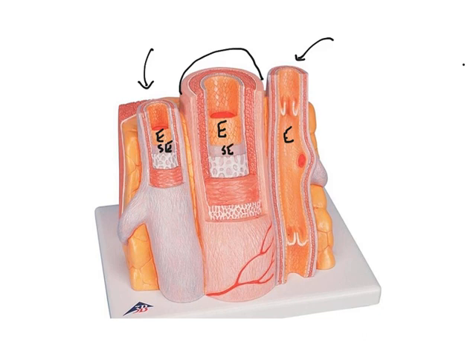Here you just have to look real careful. I'm not going to label on there because it's so thin. It's just that little gray that you see right in there. In an artery, you have this, which is called the internal elastic membrane. This is a mistake. Veins don't have that, so that should not be there. But in an artery, the tunica interna includes the endothelium, the subendothelial layer, as well as an internal elastic membrane. It's got a lot of elastic fibers associated with it. The tunica interna in a vein is just an endothelium and a subendothelial layer.